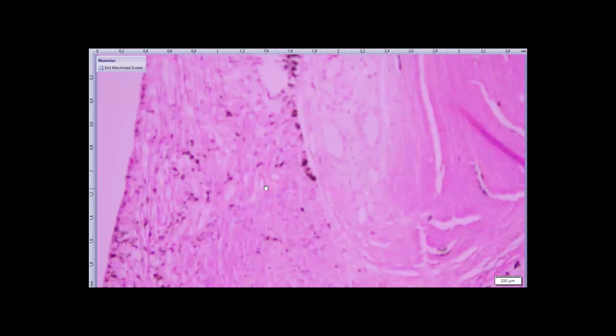We're going to try polarizing this. Oh, it's been in the whole time. We're going to try moving it around and see if we can find an area. I remember this as having a guanine.